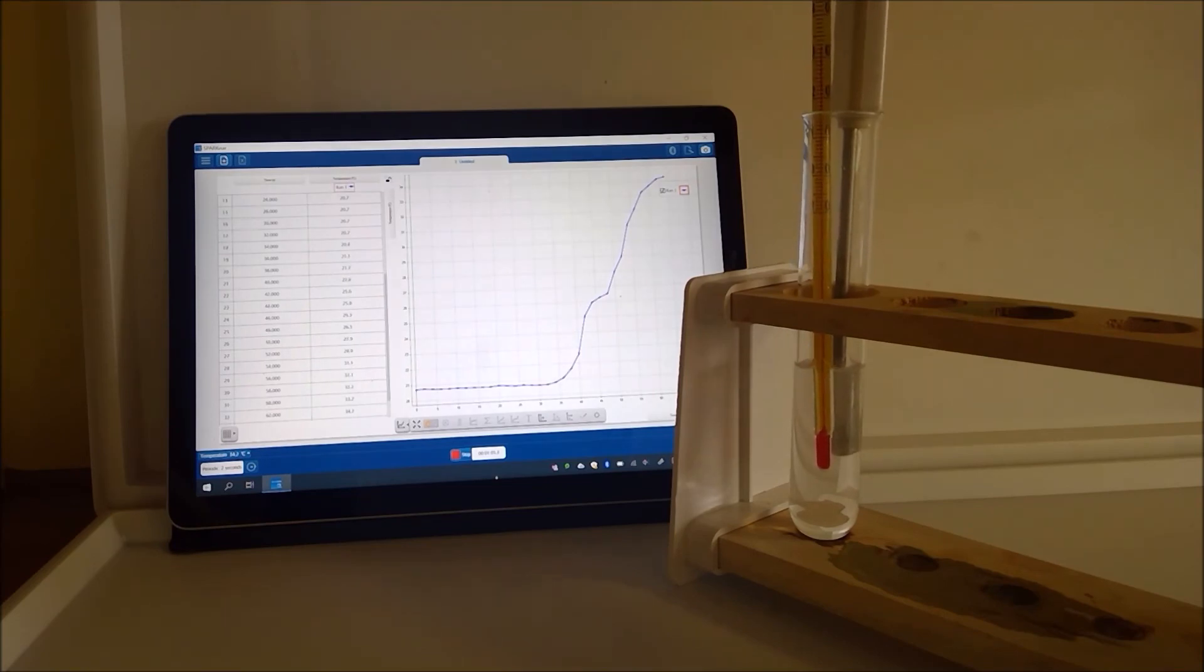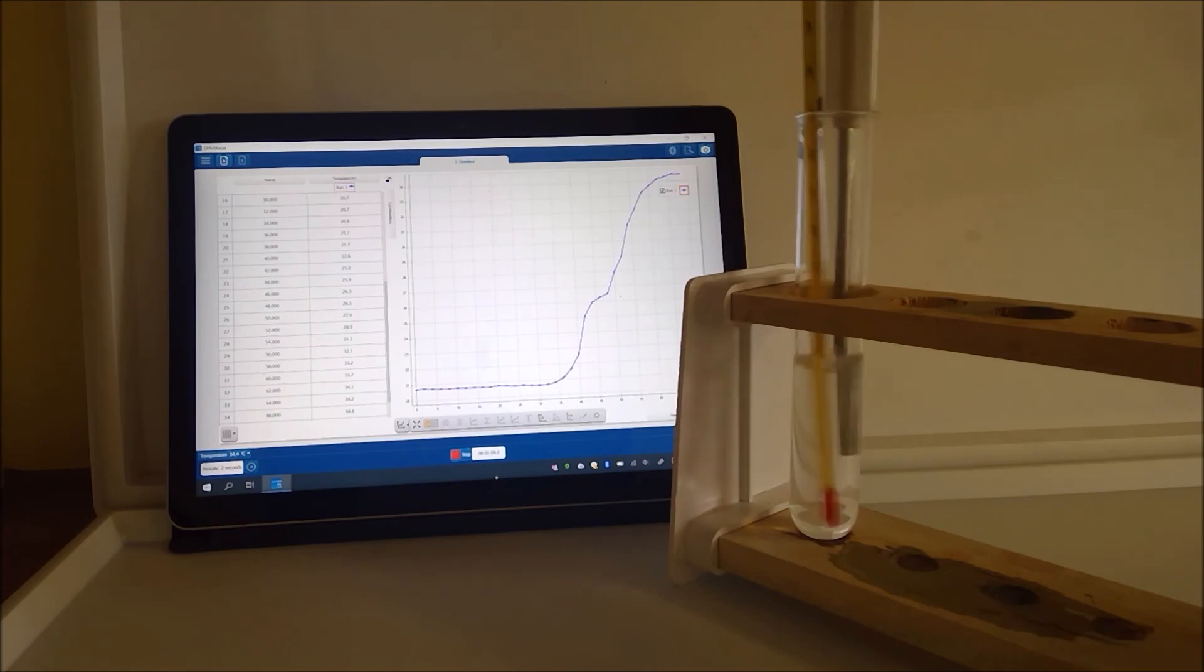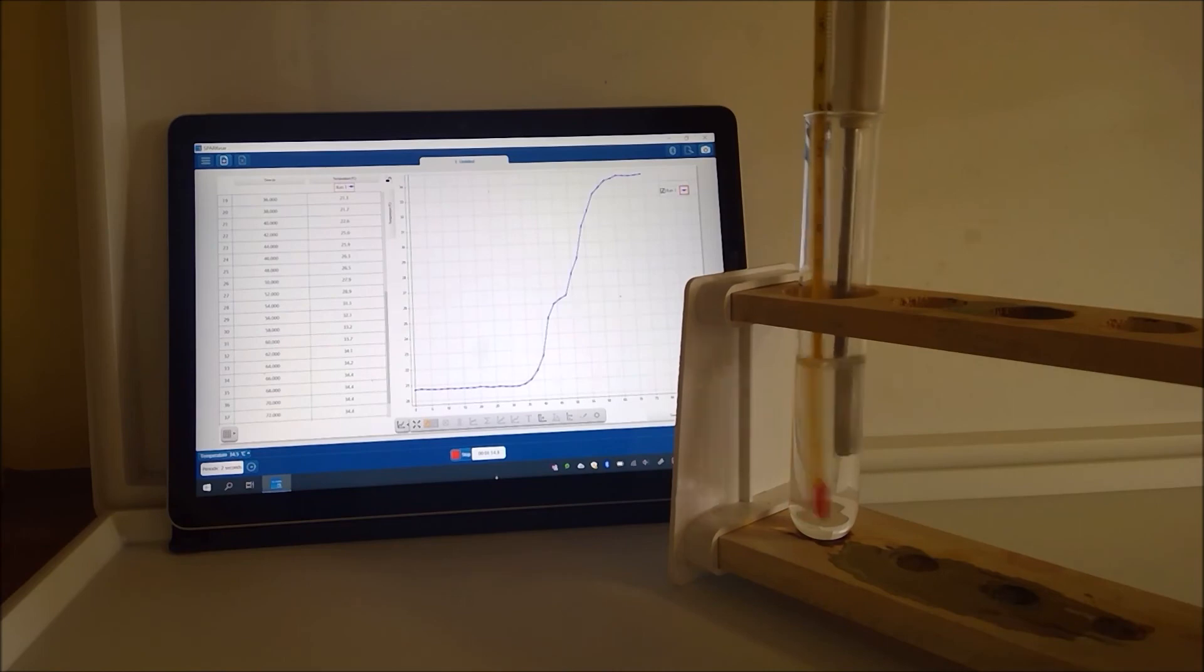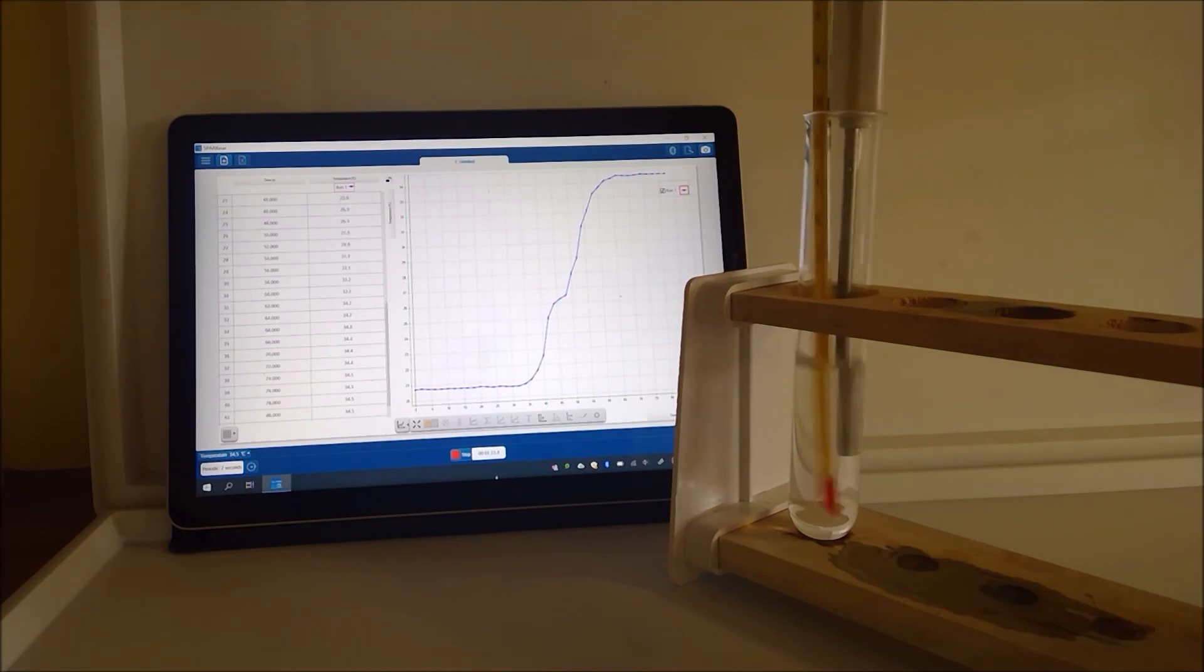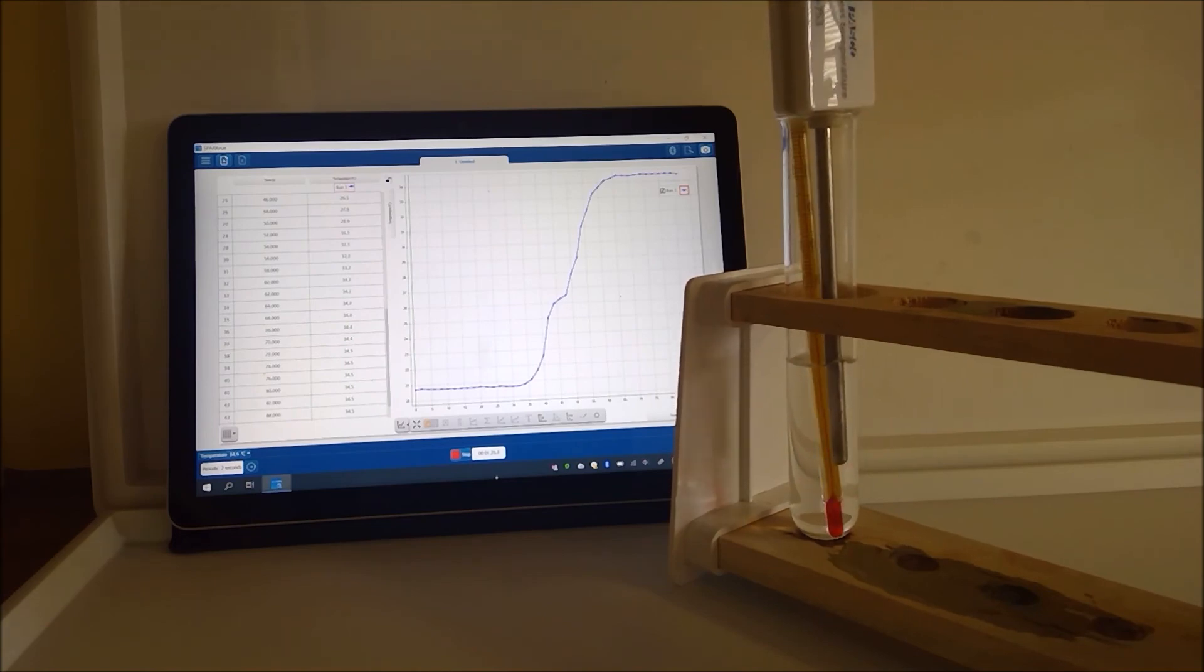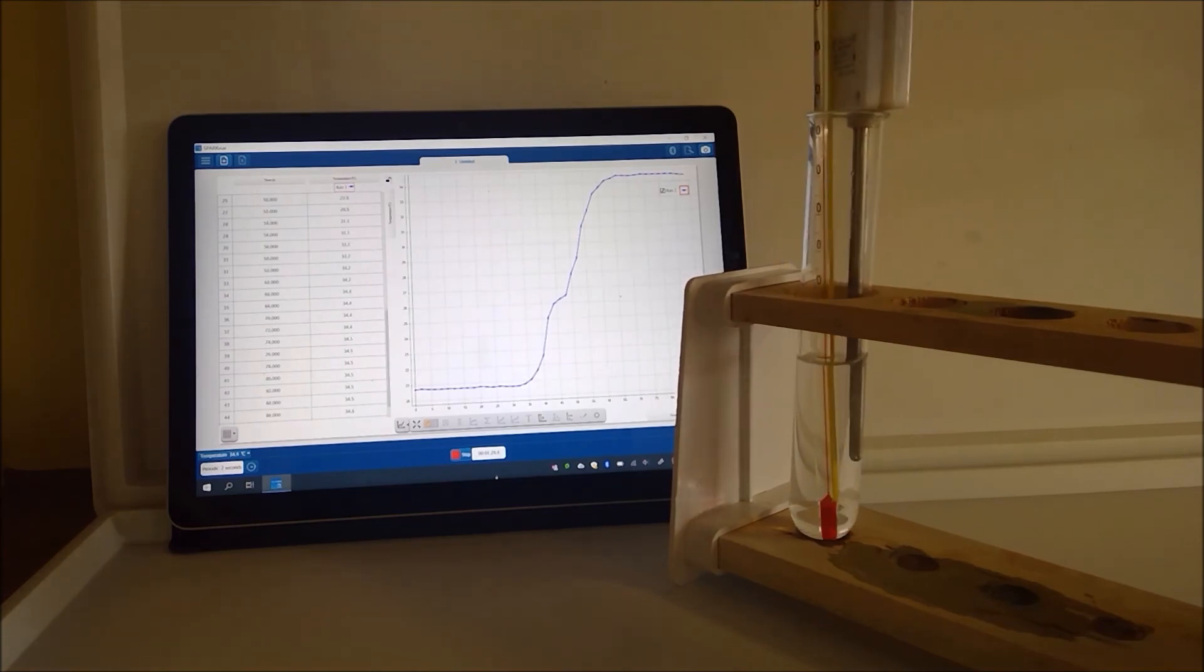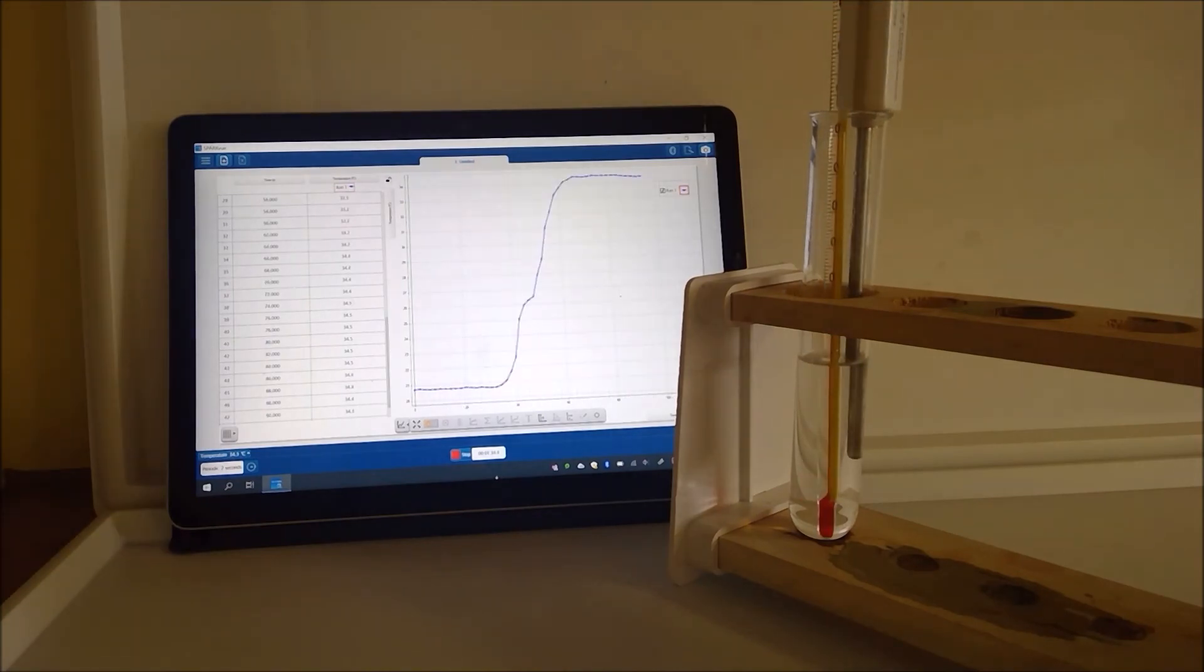And all the magnesium has disappeared there and we can see on the data logger that we have now got constant temperature up at the top. So actually I can read 34.0 degrees here. Okay with a bit of stirring and distributing the heat energy more evenly there my thermometer was in the right place to catch 34.0. Okay so on your results table again can you please make sure the highest temperature reached is recorded at 34 degrees.